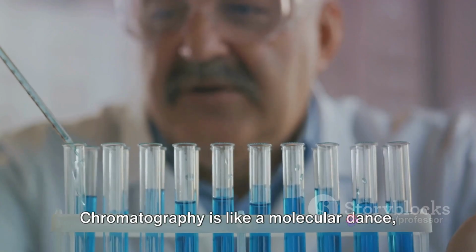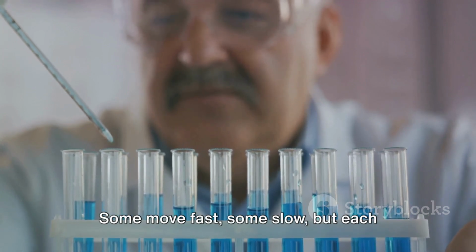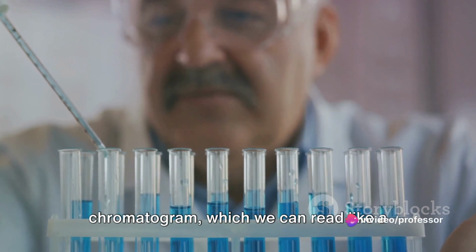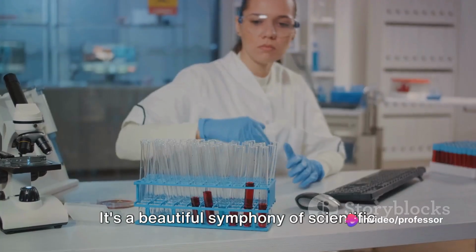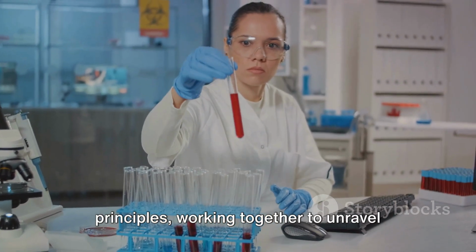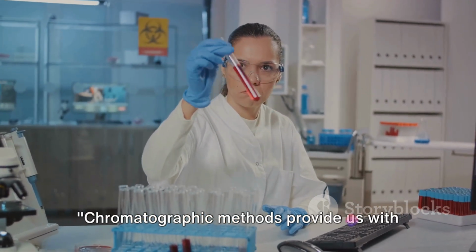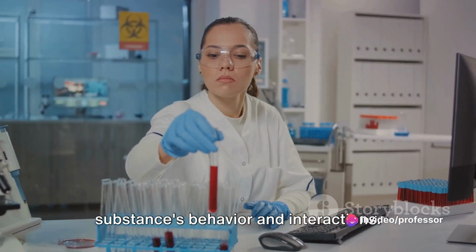Chromatography is like a molecular dance, where each substance has its rhythm and pace. Some move fast, some slow, but each leaves behind a unique signature, a chromatogram, which we can read like a molecular fingerprint. It's a beautiful symphony of scientific principles working together to unravel the secrets hidden within substances. Chromatographic methods provide us with a comprehensive understanding of a substance's behavior and interactions.